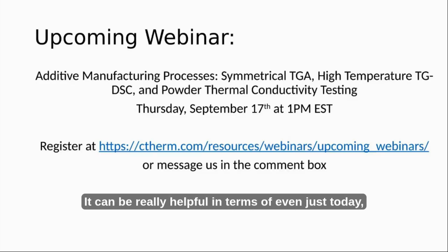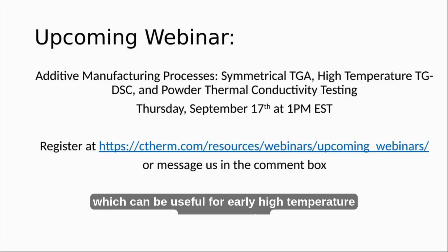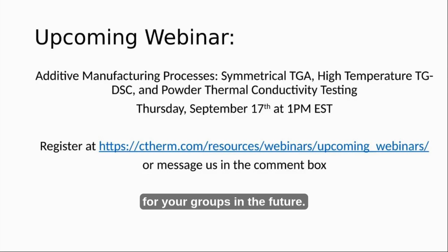It can be really helpful in terms of, even just today, we've reviewed the three most prominent transient methods for thermal conductivity. But in this guide, for example, we also discuss some of the steady state methods, such as heat flow meters and other techniques such as laser flash, which can be useful for really high temperature measurements. So the method selection guide can be a great resource for your groups in the future.